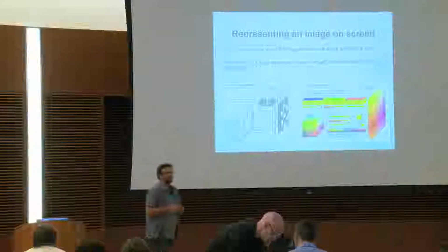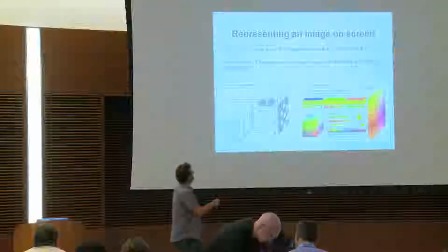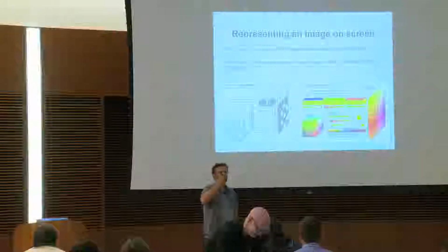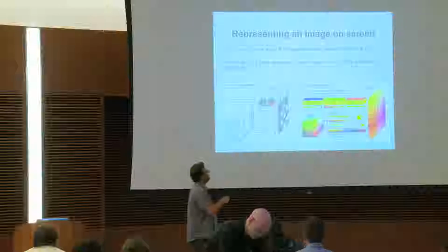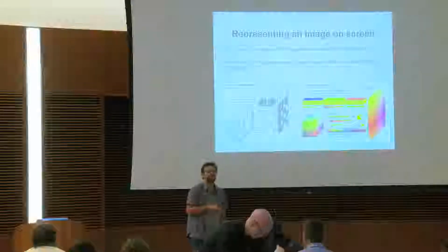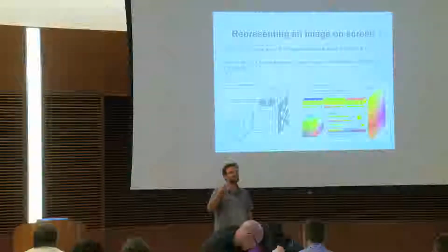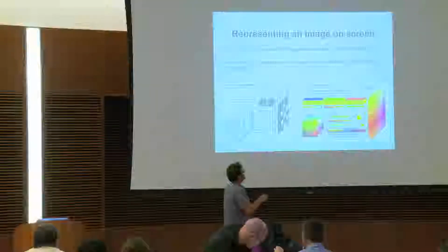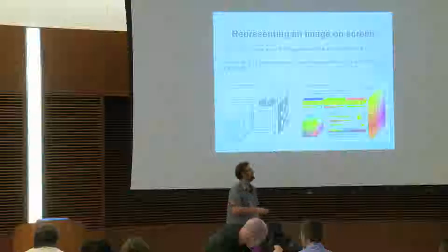When I was young, I used to have this kind of monitor where the pixel was on or off. So when I had grayscale images, I knew that the monitor was really lying to me. And now we are playing with the kind of monitors that everybody has here.